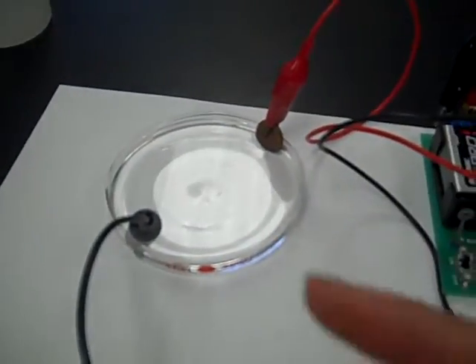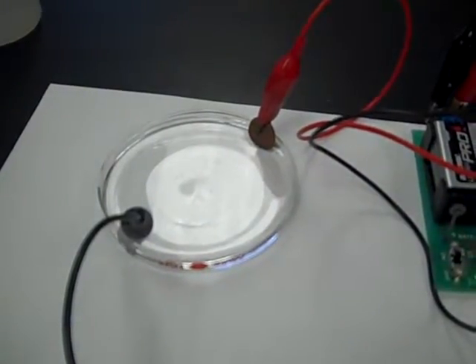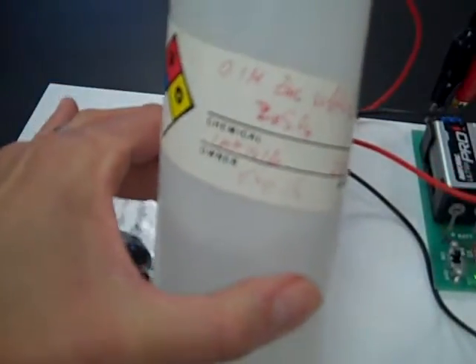The zinc metal is the anode, connected by the black wire. Inside the solution in the Petri dish, the solution is zinc sulfate.